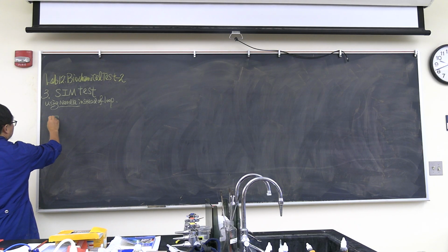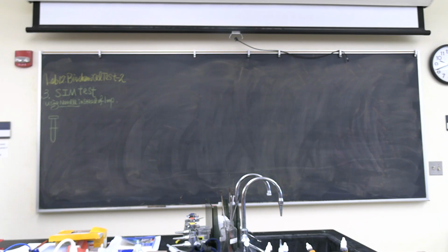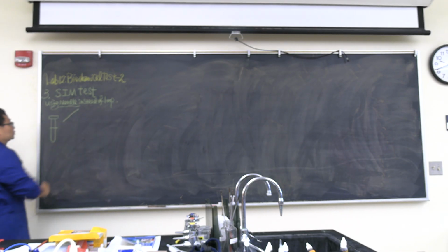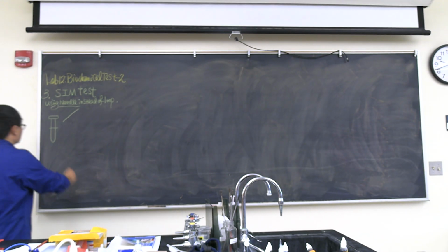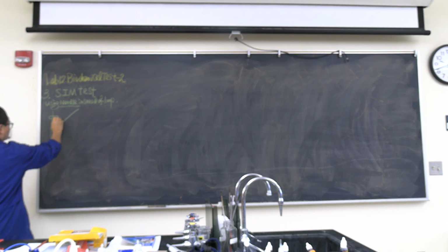You will get a medium. And then use the needle to pick bacteria. And then right in the middle, you go down and then go up.